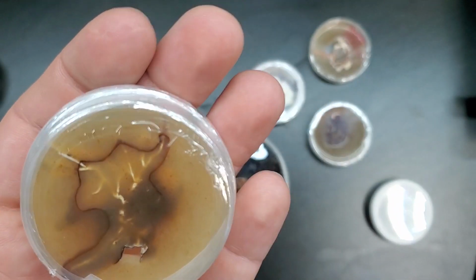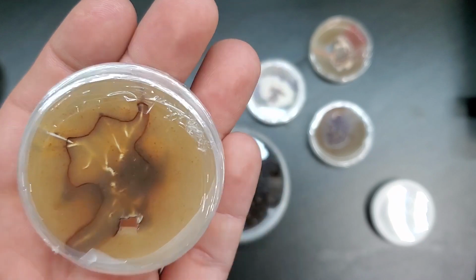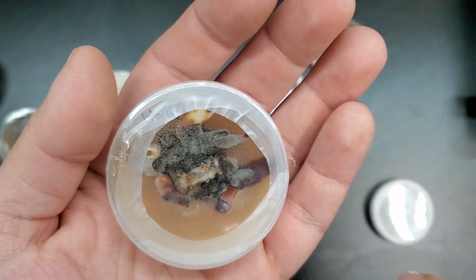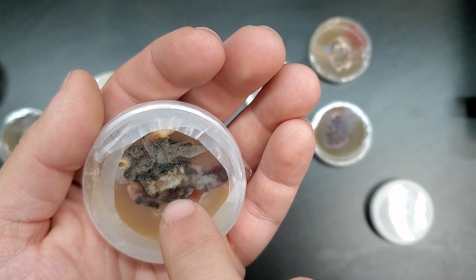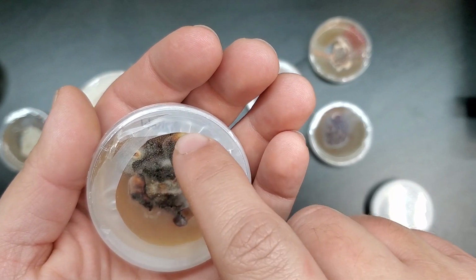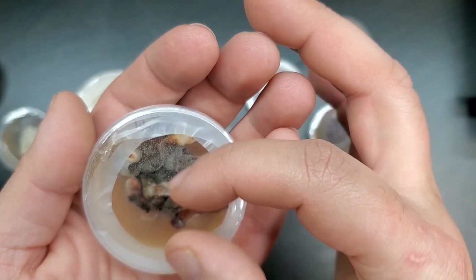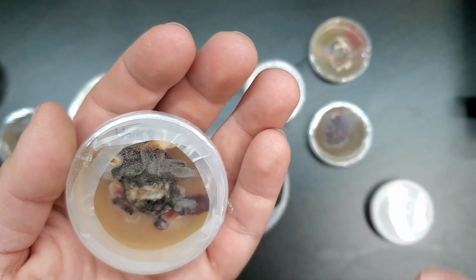In fact, I wish that I could have taken a better video of this whenever it was first doing this. But you can see right here in the middle is the initial tissue culture sample that I placed on the Petri dish. And this actually grew out. It started spreading out a little bit, just like regular mycelium that you'd be used to.